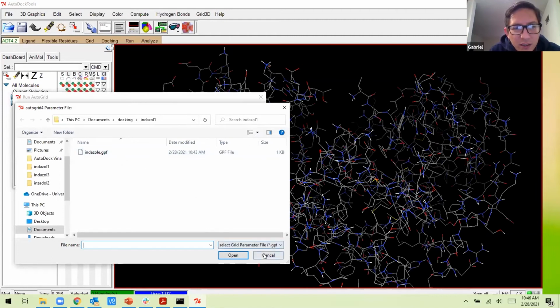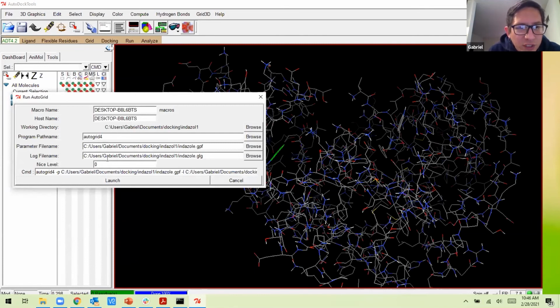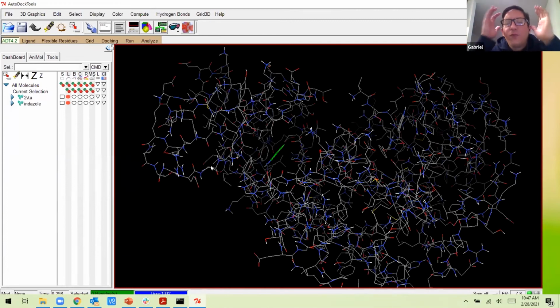You click there, and by doing that it's going to generate this other file that is called indazole.glg, which stands for grid log file. Thanks. No problem.